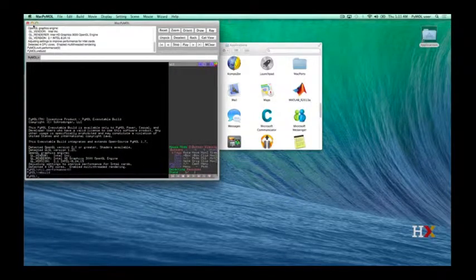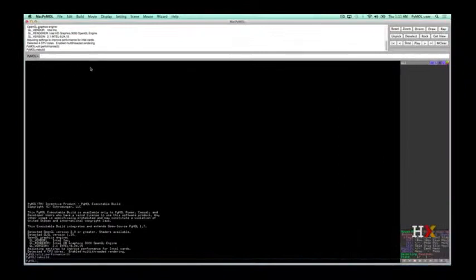On launching the application, the first thing you'll notice is the two-window interface. On Macs, the two windows are joined by default, but on Linux and Windows operating systems, they have separate windows. The top window is referred to as the external window, and the bottom window as the main window. The external window has menus across the top and a panel of buttons for frequently used functions.